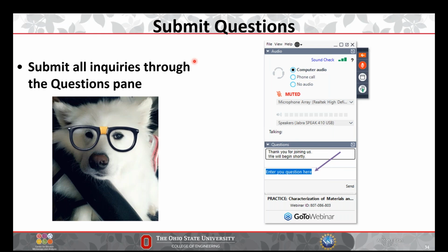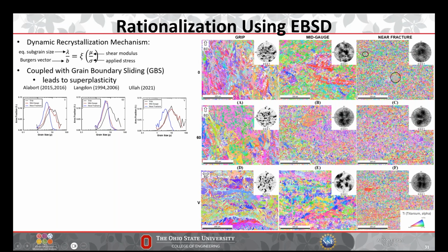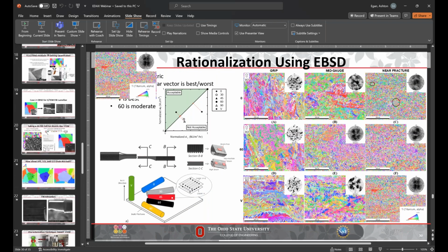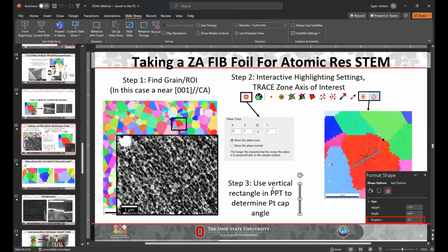How do you identify different phases in single crystal grains? Yeah, so in a single crystal, I think you're talking about gamma and gamma prime, maybe, which are indistinguishable if you're looking at just an EBSD map. But in TEM, you could tell the difference between gamma and gamma prime. If you're talking about ECCI, I think maybe I did show this in one of my ECCI images. Let me quickly go back here. You can actually see the gamma and gamma prime. So this is one example.